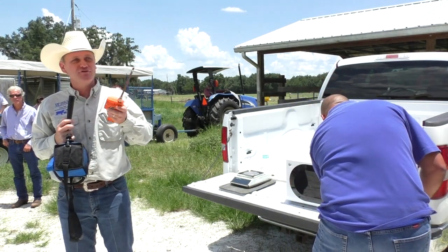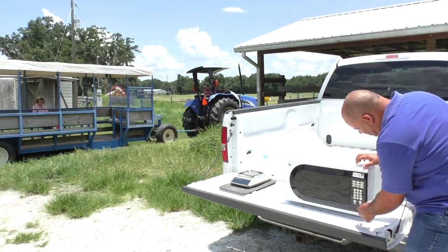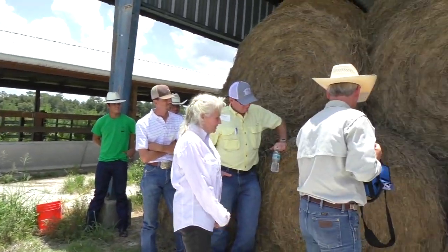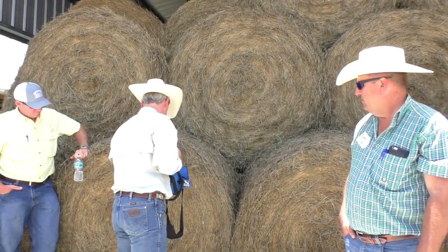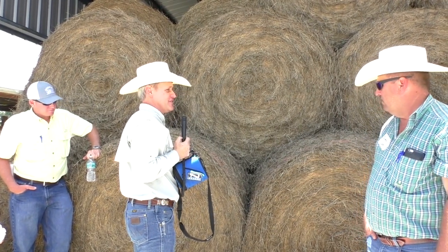With this meter, I'll just measure the moisture of this hay for you to see how easy it is. If you stick it in — 12.5%. It's a little easier, isn't it?